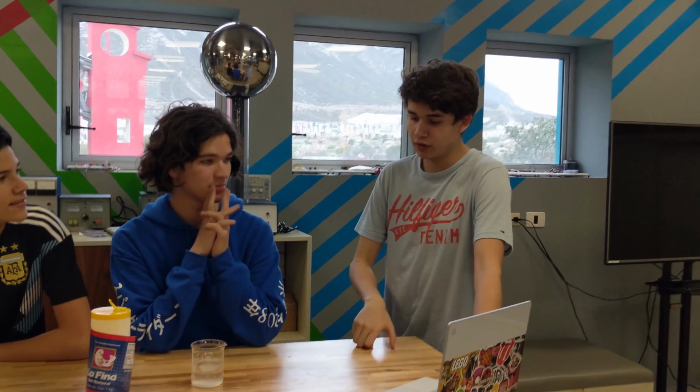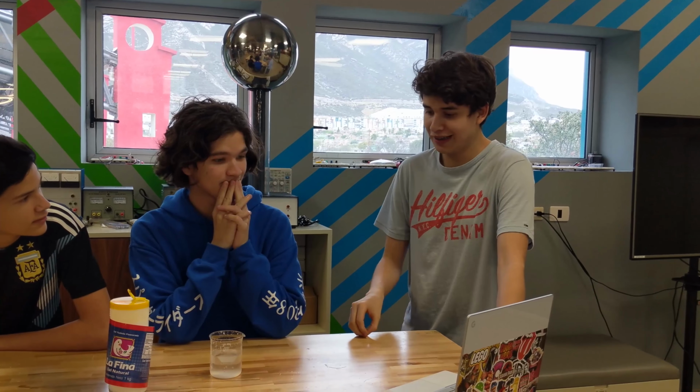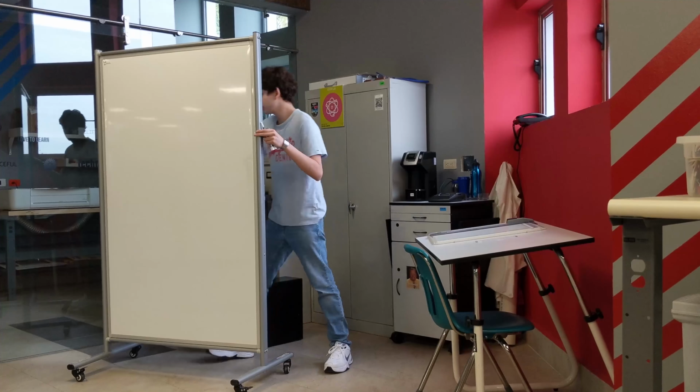Right, you have 2 salts, and one of them causes an endothermic reaction, and the other causes an exothermic reaction. Let's see which one's which. When my ammonium nitrate dissolved in the water, the system absorbed heat from the surroundings, making the flask feel cold. Yes, that's a perfect example of an endothermic reaction. Here, let me show you how it's done.